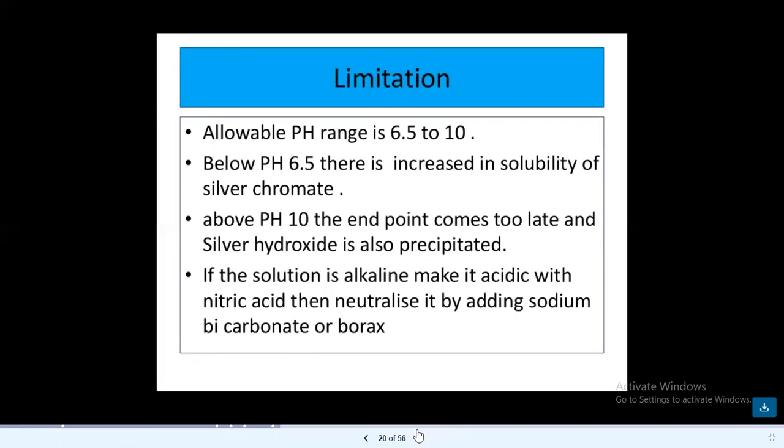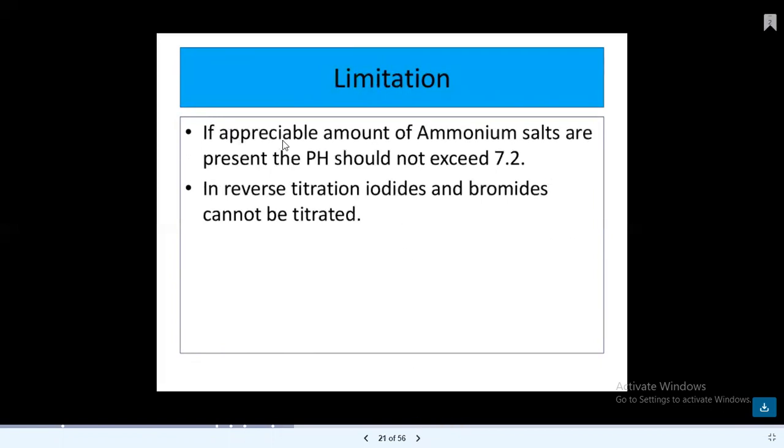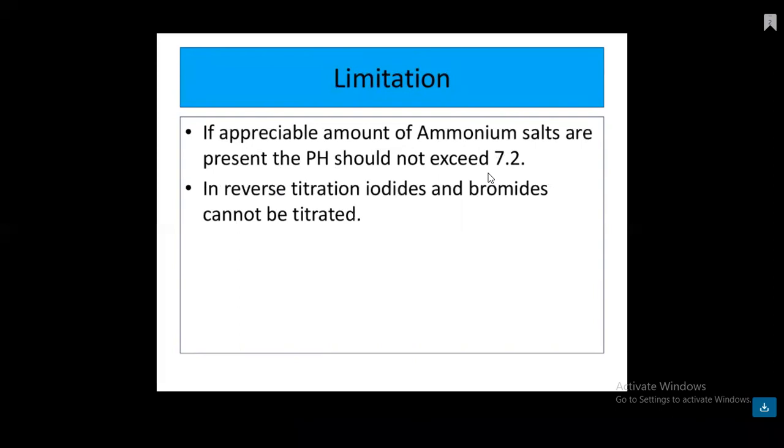And another limitation is that if an appreciable amount of ammonium salts is present, the pH should not exceed 7.2. ठीक है, ammonium salt that is used either in the form of a buffer or other thing, the pH should not exceed that.